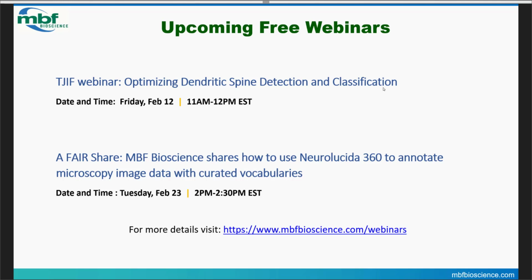What we've found is that we can use DAPI. Fluorescent Nissl, DAPI, other modalities actually do work fairly well with the 2-photon atlas. You'd have to just try them.